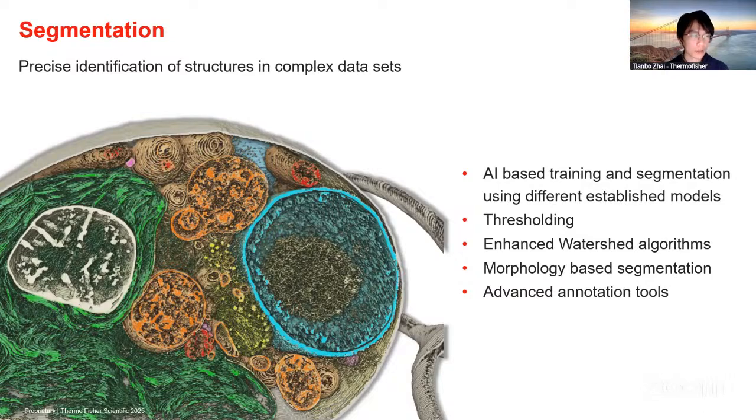Nowadays, there are plenty of tools that everyone could use, and many of them are open source. Image analysis algorithms by themselves are not a secret or anything. Many of those algorithms are based on open source algorithms. And so essentially you have many different ways to achieve your segmentation goals.